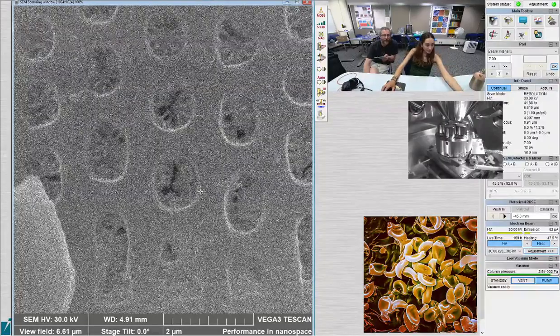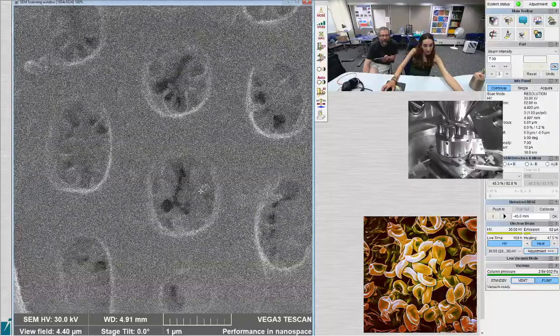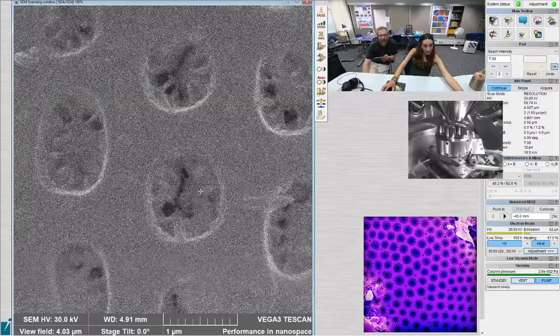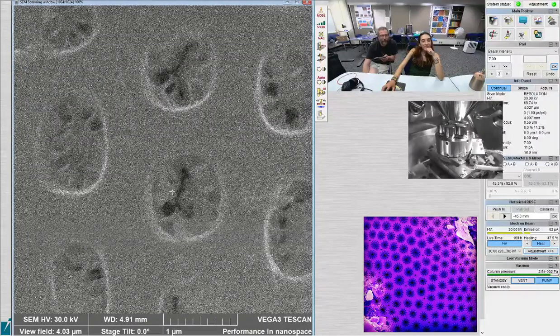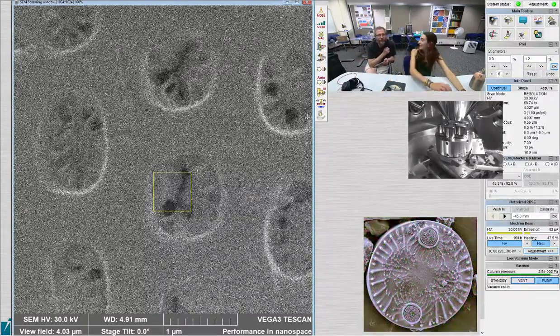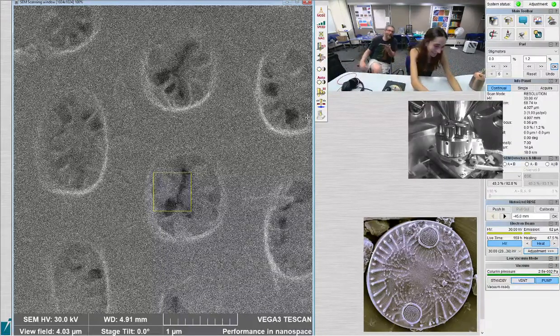Oh, wow. Look how pretty they are. It's got, like, spider web coverings over the pores. Those are some of my favorite ones. Yeah, and then just click the stigmation button, and then play with those knobs. Oops. It can't get worse. It can only get better. We'll get it back to this point at least.